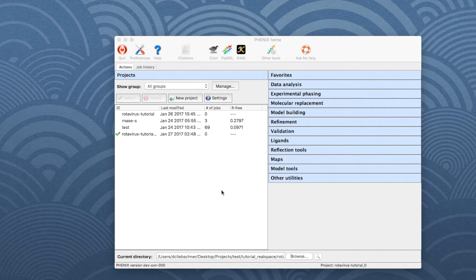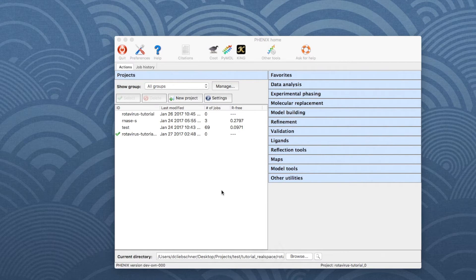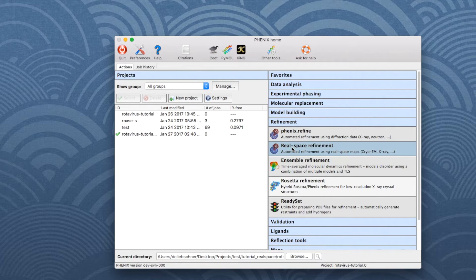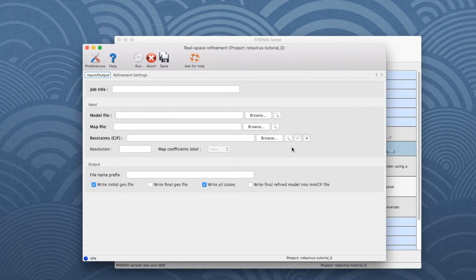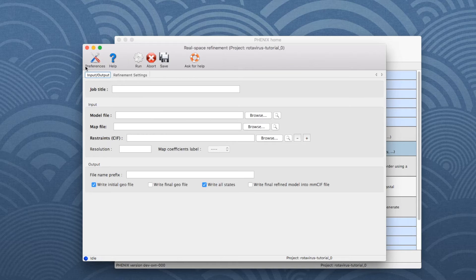To run Phoenix RealSpace Refine, open the Phoenix GUI. In the panel on the right-hand side, choose Refinement and then click on RealSpace Refinement, which opens a new window. Go to the Input Output tab to add the example data.